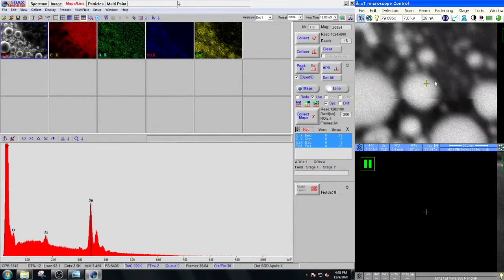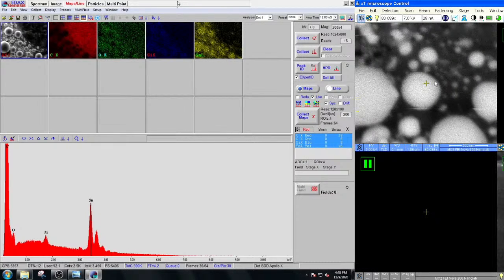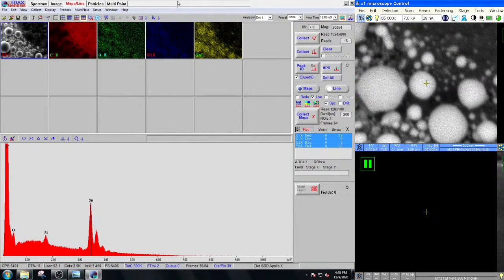Because you're going to have to be able to get the Nova resolution much better to do this kind of work. You can't rely on it to just be in mode 3 all the time.